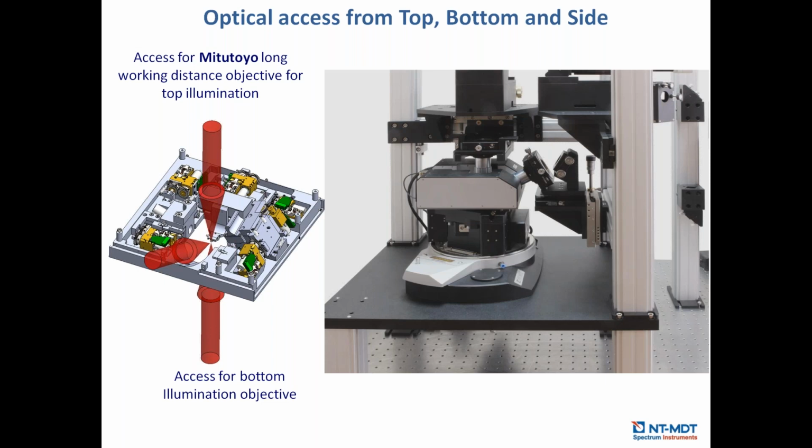Yeah. We are using a mixture of gold and silver. Silver gives us a stronger enhancement, and gold gives us better stability. Also, the coating has some nanocrystalline structure to be stable during a longer time. So the resonance frequency, according to our experiments, comes closer to 600 nanometers, in the red region, not to the green as is typical for pure silver. So we use a mixture of both metals.